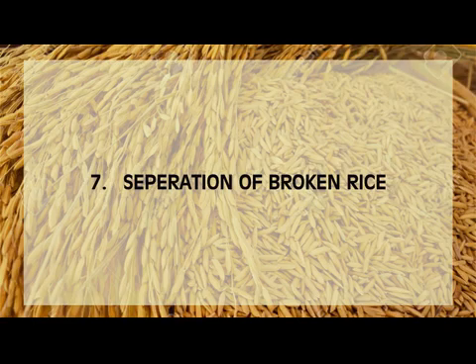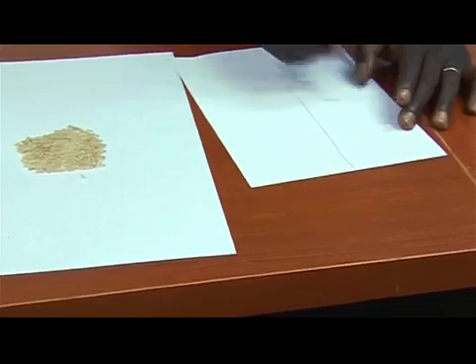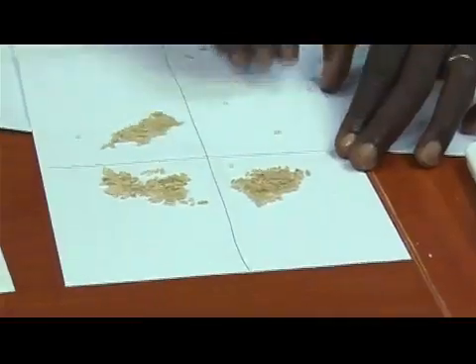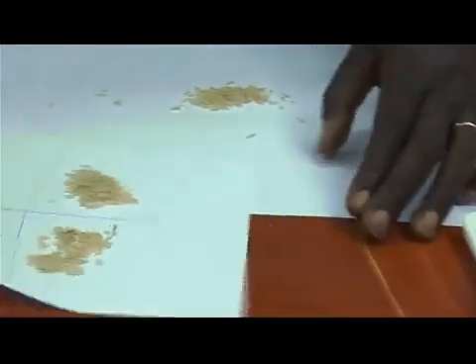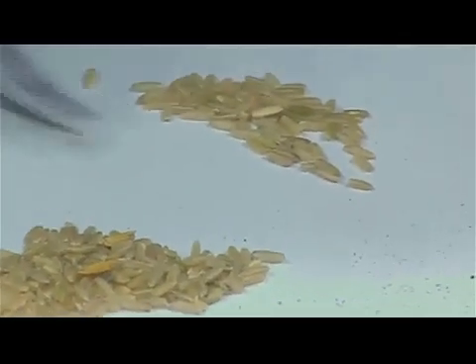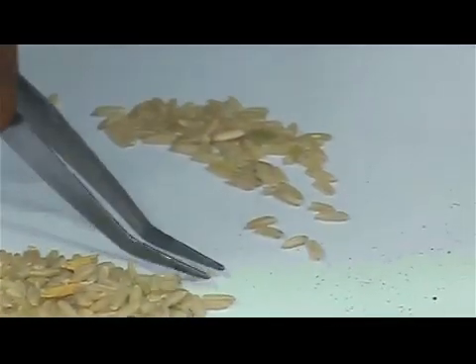Separation of broken rice. Brown rice which did not pass through the sieve may also contain broken grains. Manually separate the broken grains from whole grains. Because of the large number of grains, we use the quadrant method to randomly select half of the lot for manual separation.